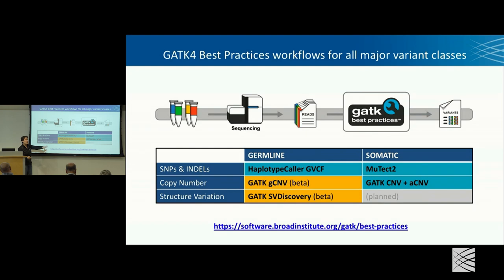They include other software besides GATK, but GATK is the main recognizable toolkit. I have an appendix at the end of the slide deck, which will be shared, that lists the other tools like Picard, IGV, BWA, and so on, that you can get pointers to if you're interested in knowing what else is in there. But I'm mainly going to focus on the pipelines and the logic of the workflows and the logic of the analysis for each of the major types of variant calling workflows.